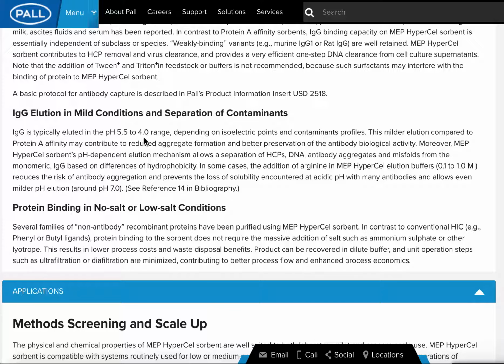Give me one quick second. Let me go through my other file that I have opened up on another laptop to confirm what they have as an elution pH. Give me one quick second. Clean 2 volumes, 3 CV, 4 CV, 9 CV.